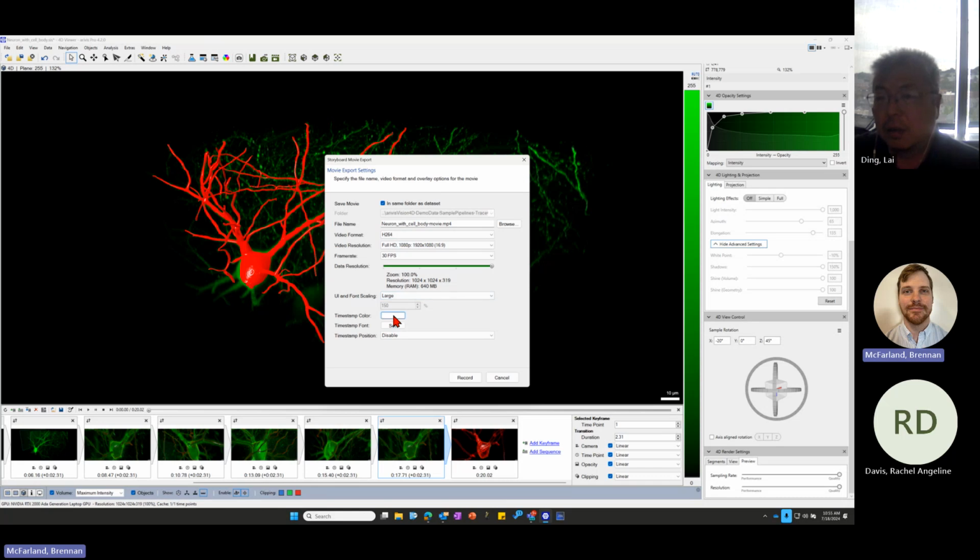And say large. You can also add a timestamp to this too, so people know how long the video is. So this is 20 seconds. We can have that attached.